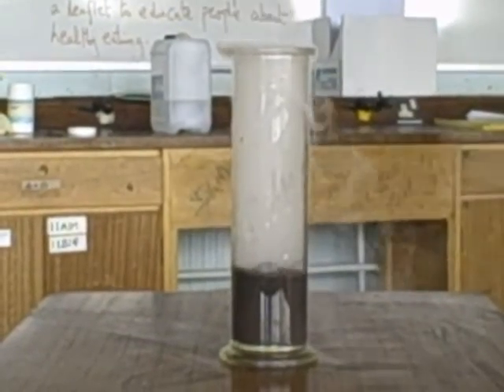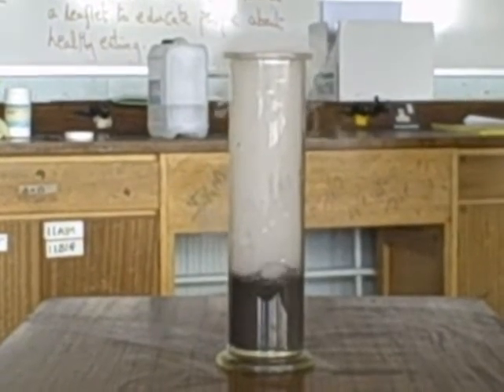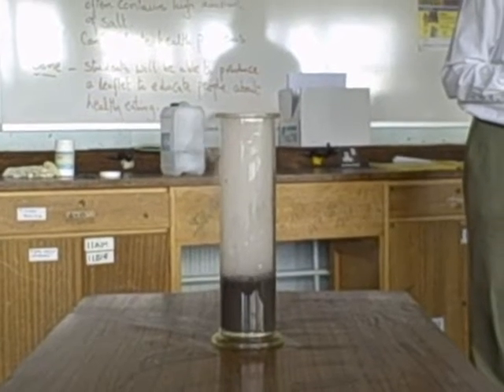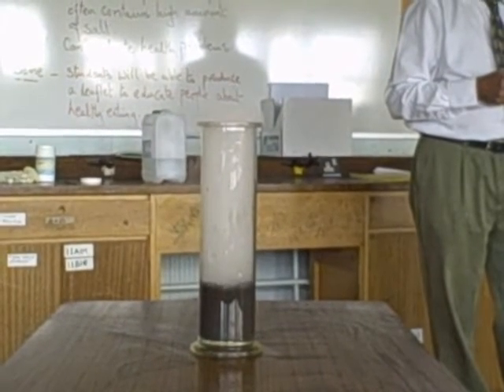You can see the reaction is beginning to slow down now. This is because most of the hydrogen peroxide has broken down into water and oxygen. Eventually, it will stop.